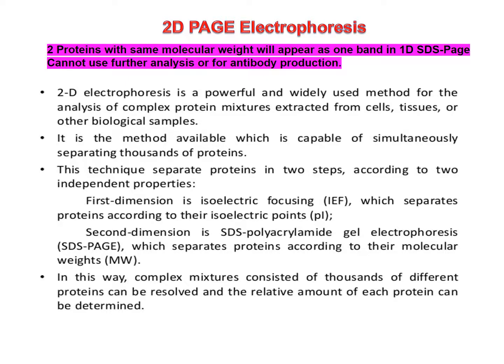It's the second dimension. First dimension is isoelectric focusing. Second dimension is what we did in the 1D. We separate by their molecular weight, their mass, with SDS. So in this way, complex mixtures of thousands of proteins can be resolved.